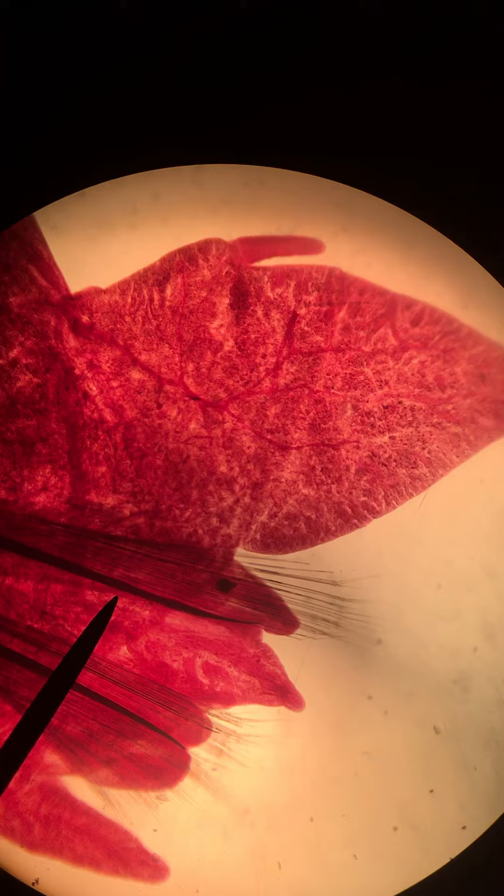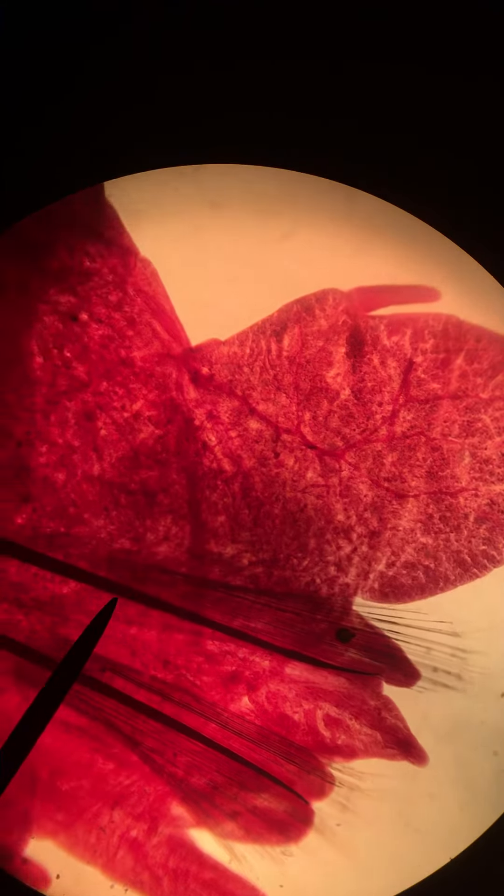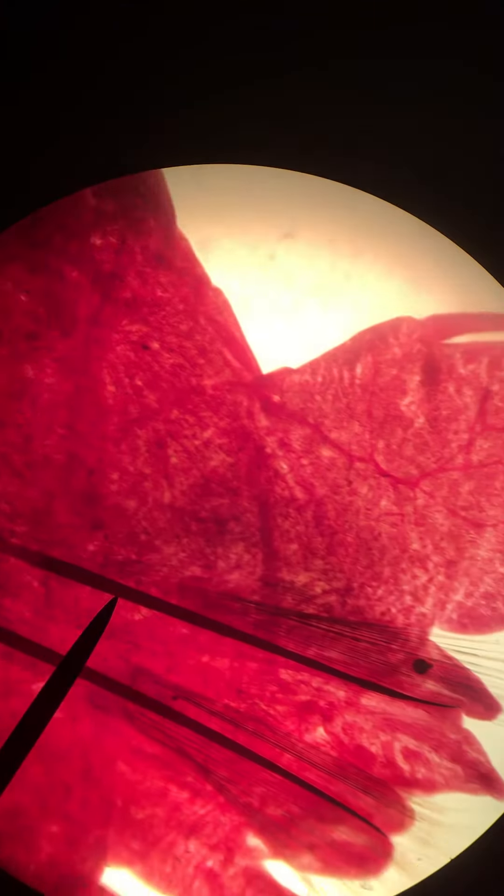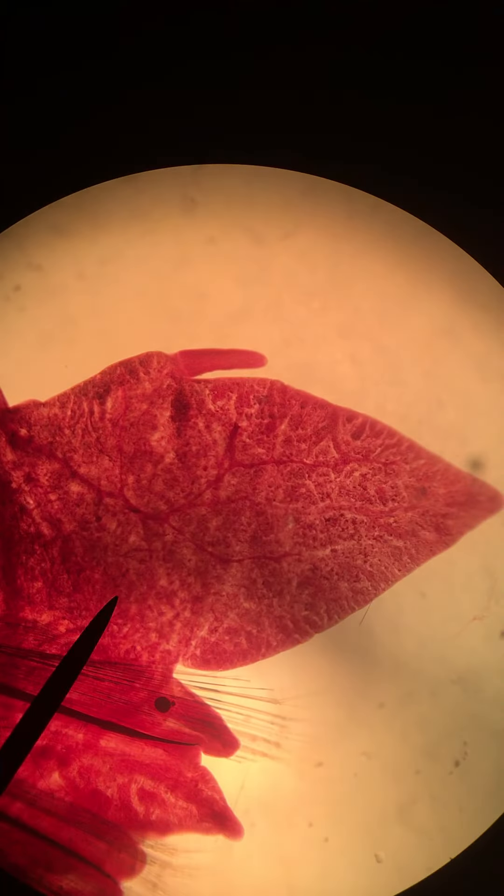As you go from head to tail, there are lots and lots of body segments and each segment has its own pair of parapodia. The parapodium itself has been detached from the worm already, and it has a branched structure.